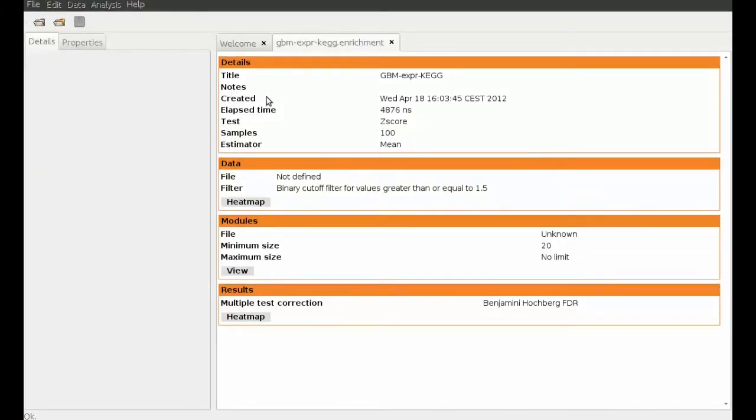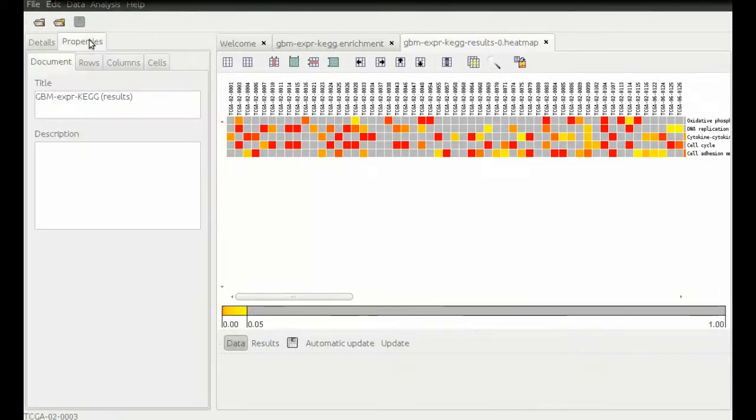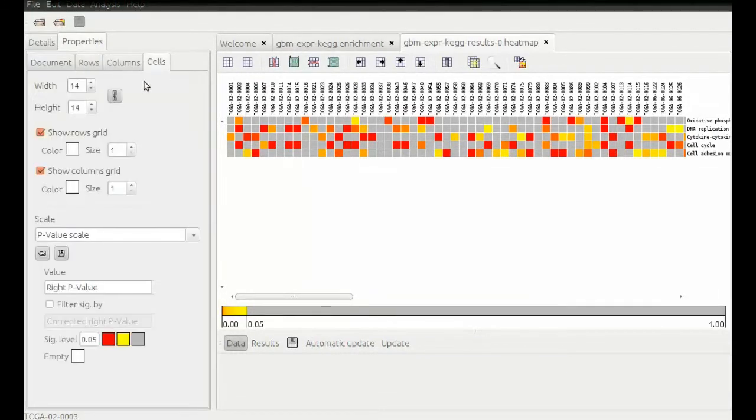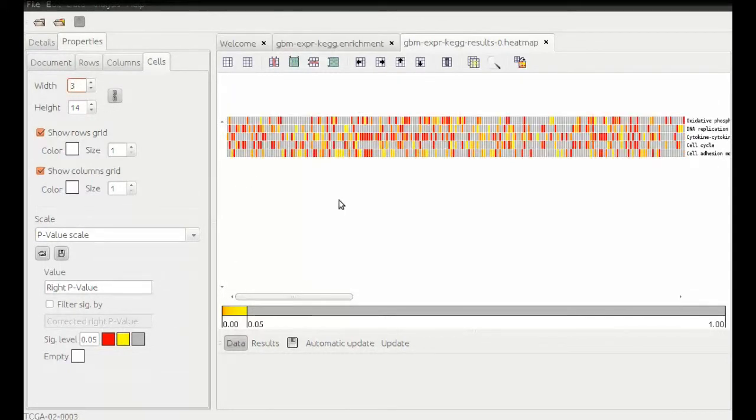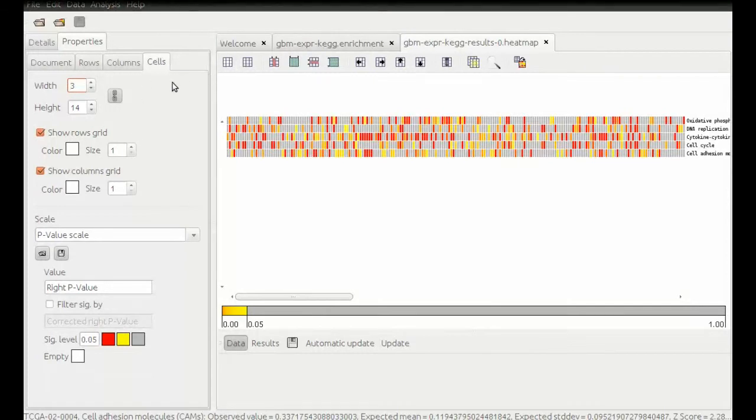Once the analysis has finished, we will open the result matrix. So the modules file contained the five pathways, which we can see now as rows. In the columns, we have the same samples as in the original data. We can see which samples show differential expression in which pathways.